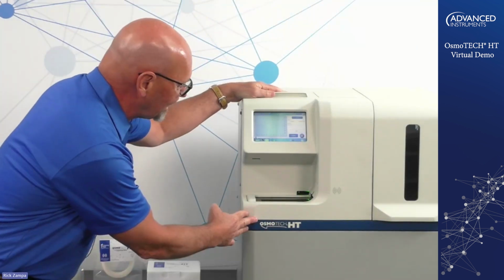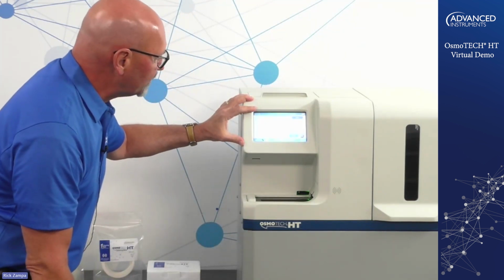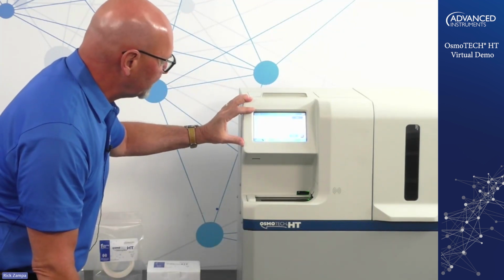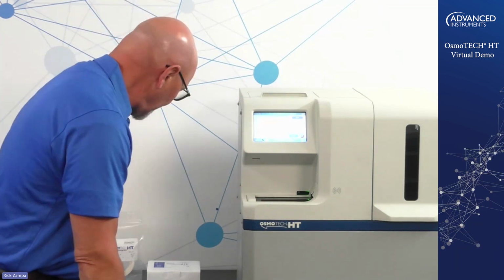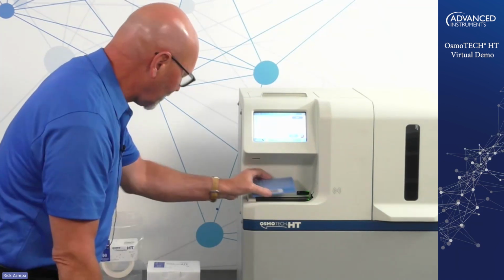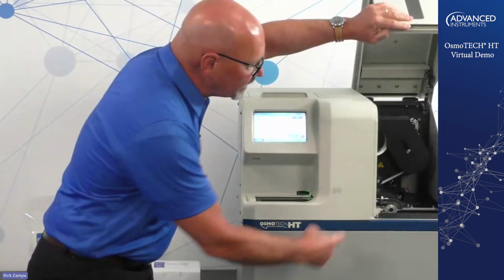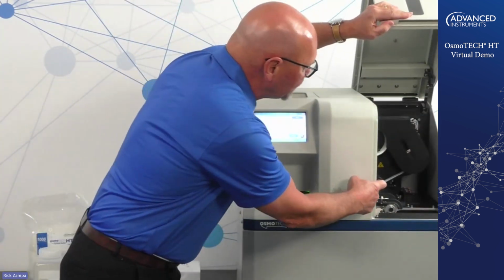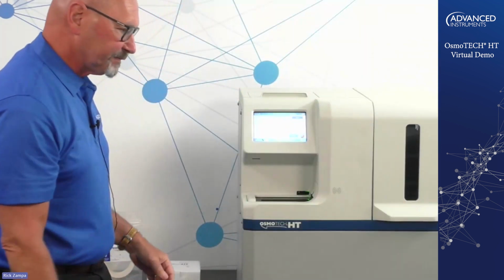The OsmoTECH HT osmometer. You can see here, we have a touchscreen display where you'll input all your information for your testing. You have the belt here where your plate will go on. So we have our 96 well plates, which will go in there. We have the hood over here on this side, which is where your osmometer module is, and your cleaning, and your 96 well plate moves into there for testing.